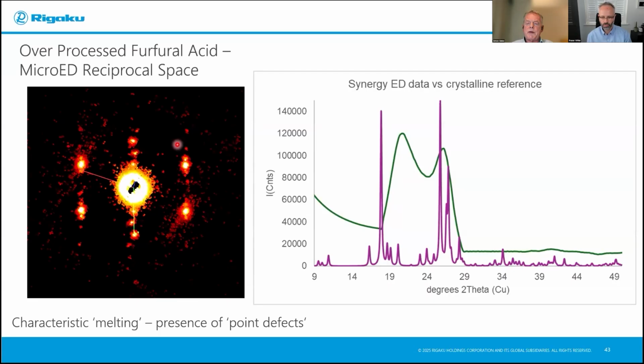And this is something we typically see in APIs that have been milled down to small particle size, to increase manufacturability. We can then begin to analyze this to understand what's happening, how is it disordering, how is this going to affect dissolution rates, how's this going to affect bioavailability, what's the performance of my drug product going to be like with these high defect materials.